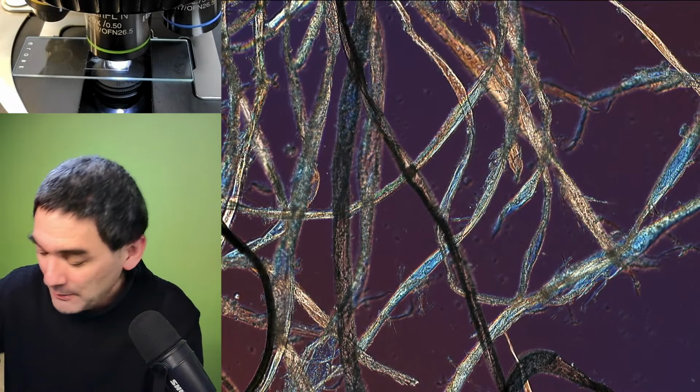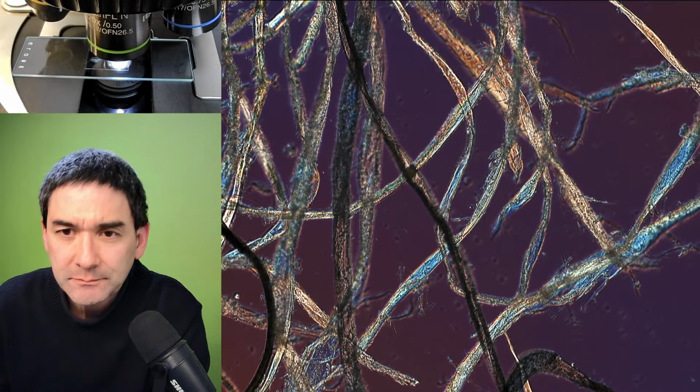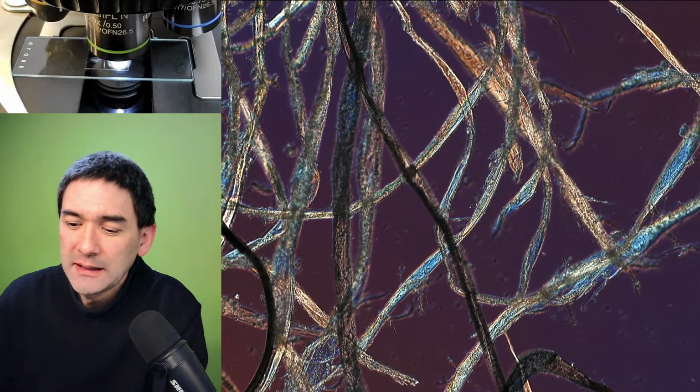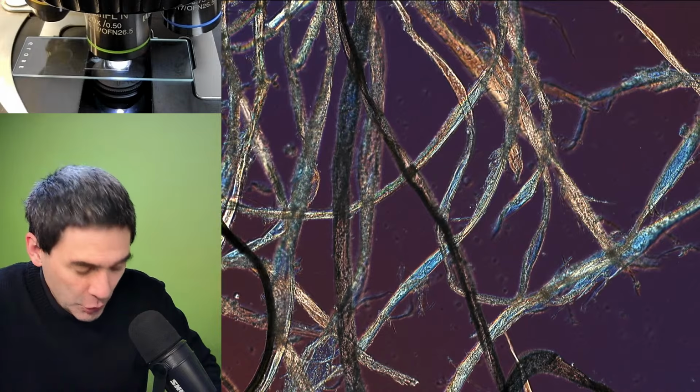Here we go. There was a question about a microscope camera, and I tell you the following. This is a complicated question. Basically, what I would suggest is there is no ideal microscope camera.